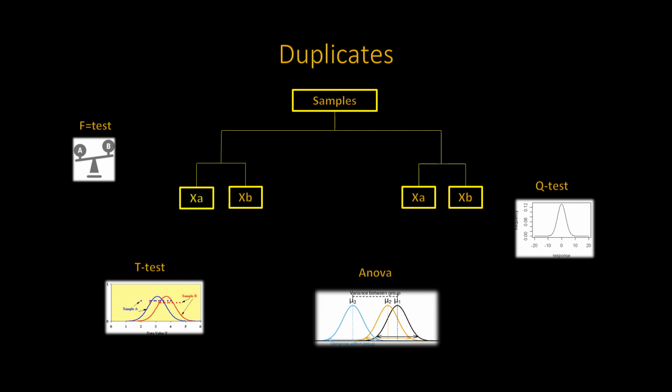Most of you will not be conducting any solutions chemistry for instrumental analysis. In most instances, you may be doing it for fire assay techniques or sieve analysis. If this is the case, then a single duplicate may be taken and the result between XA and XB will be used to identify if errors are induced.